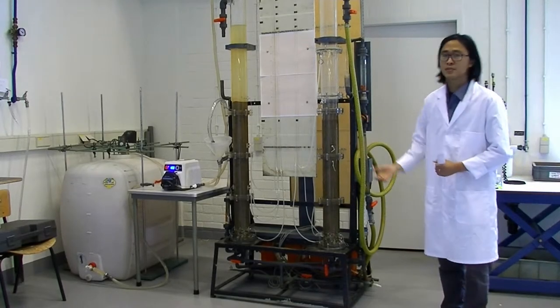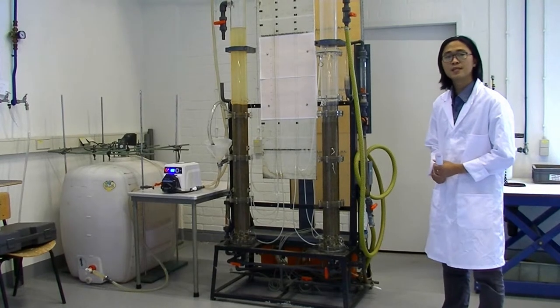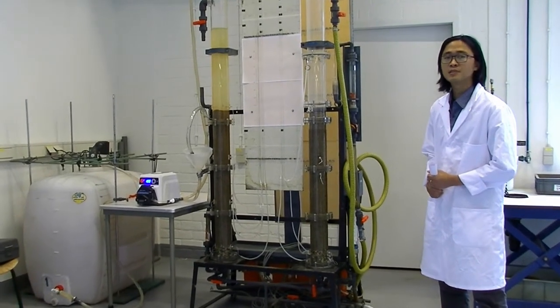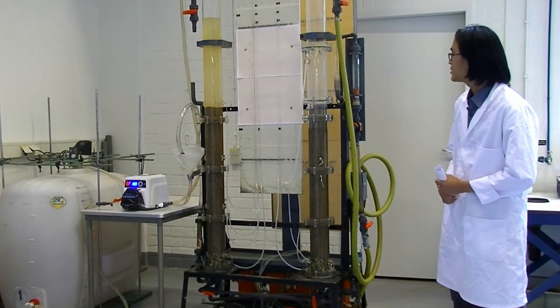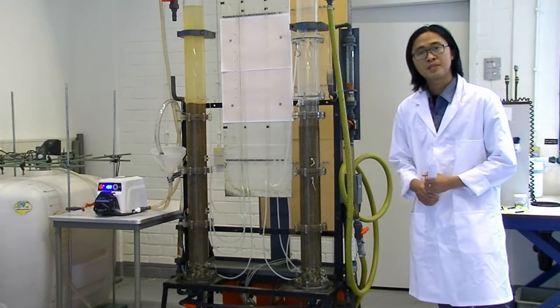This is our pilot filtration setup we have in UNESCO-IHE. It consists of two parallel filter columns made up of 10 centimeter diameter Plexiglas tubes.